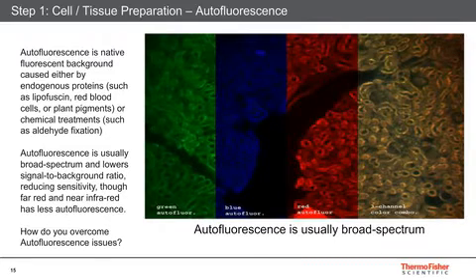And there are a lot of different things that can lead to autofluorescence. It could be overfixation with aldehydes, especially glutaraldehyde. It could be the effects of xylene from your deparaffinization. And it could be endogenous proteins like lipofuscin, which makes those age spots in old people, right? Well, lipofuscin's also in tissue, especially brain. Or red blood cells are autofluorescent, or certain plant pigments.